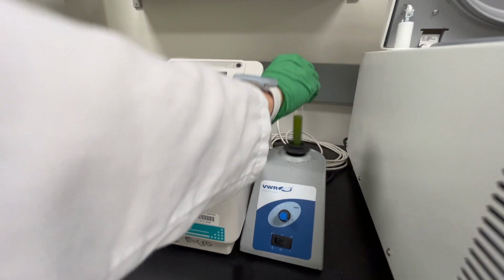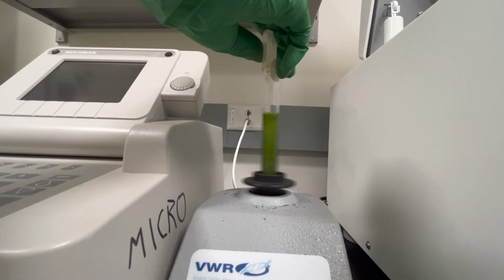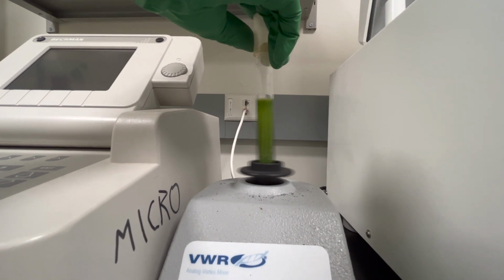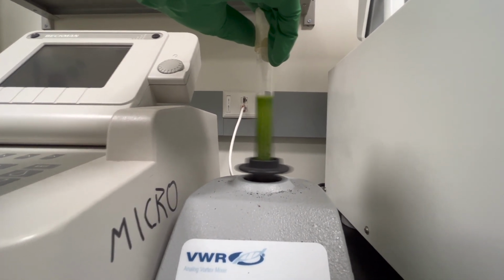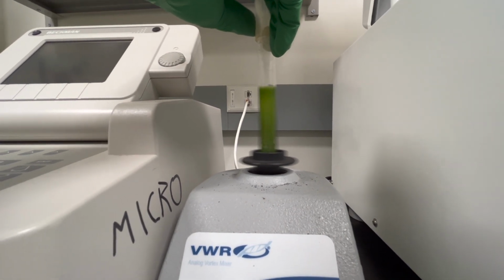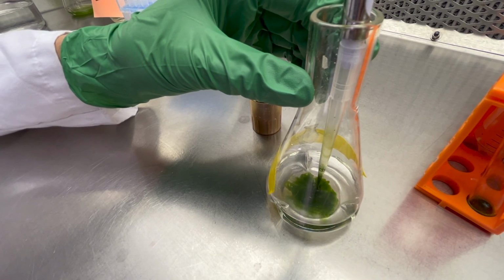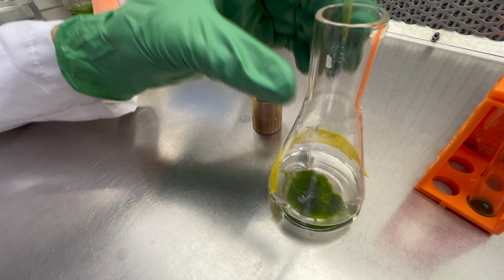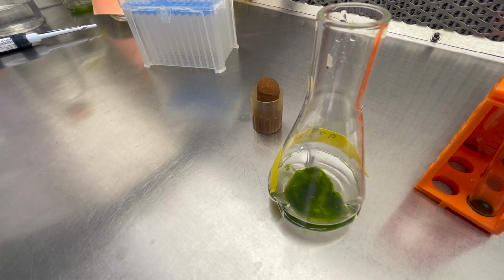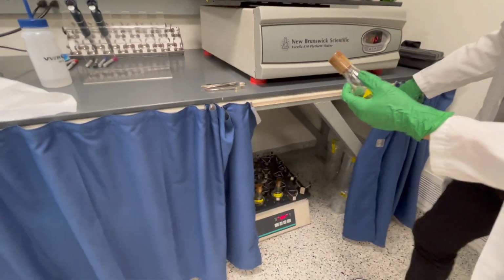6. Vortex the tube at the highest speed for 15 seconds immediately after adding polyethylene glycol. 7. Transfer the vortexed cells into a 125 ml flask containing 30 ml of tap medium. Ensure that no glass beads are taken up alongside the transformed cells. 8. Place the flask on a shaker at room temperature for 24 hours in the dark to allow the cells to recover post-transformation.